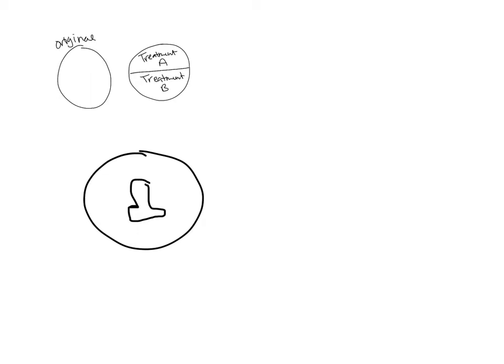And what you'll do is you'll take your swab. So you have this cotton swab, right? It's a sterile swab. So when you take it out, you're not going to want to touch it to anything. You're going to hold the end of it over here, and just right before you swab is when you'll take it out of its sheath. And so what you'll do is you'll take that swab and you will swipe it across the surface that you're sampling, across that surface or object or place. And then what you'll do is, without moving it around in the air too much, because you'll pick up other bacteria, you're going to take your plate.